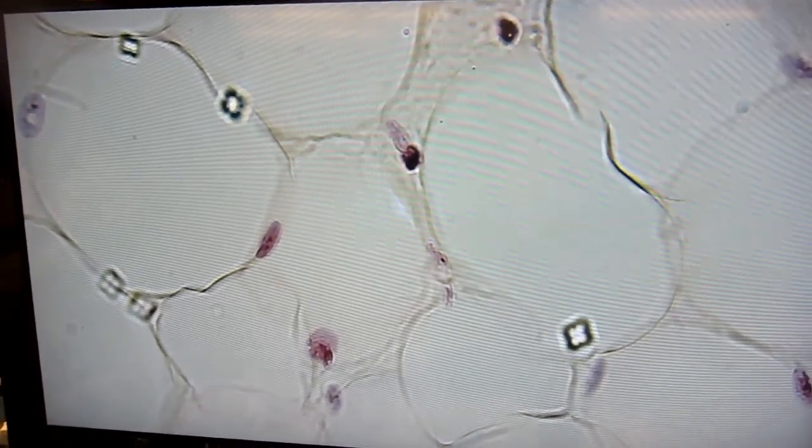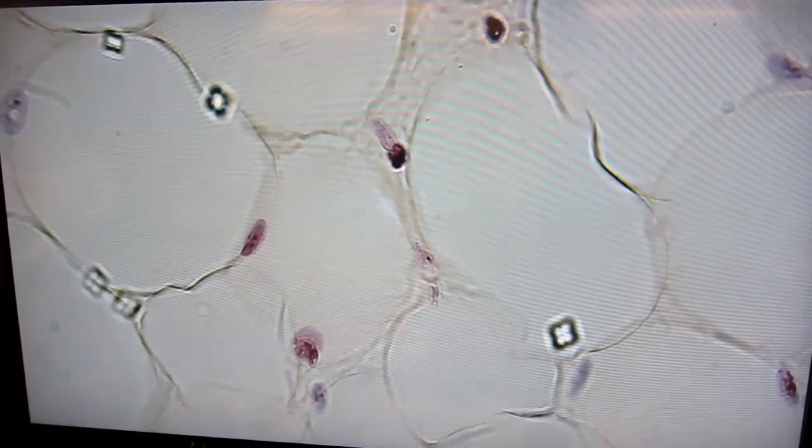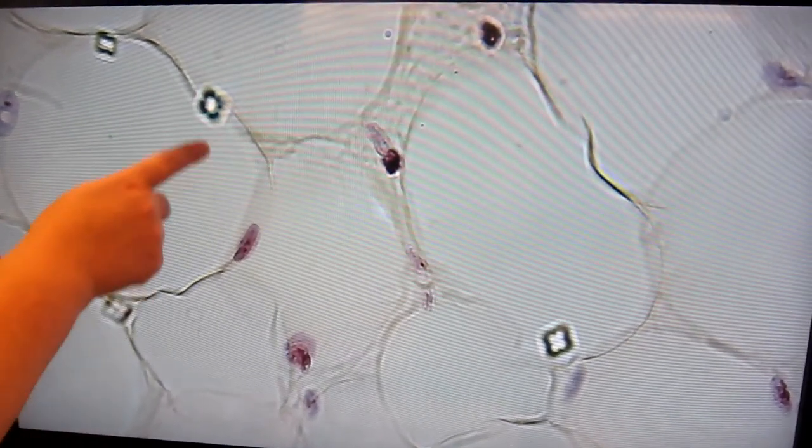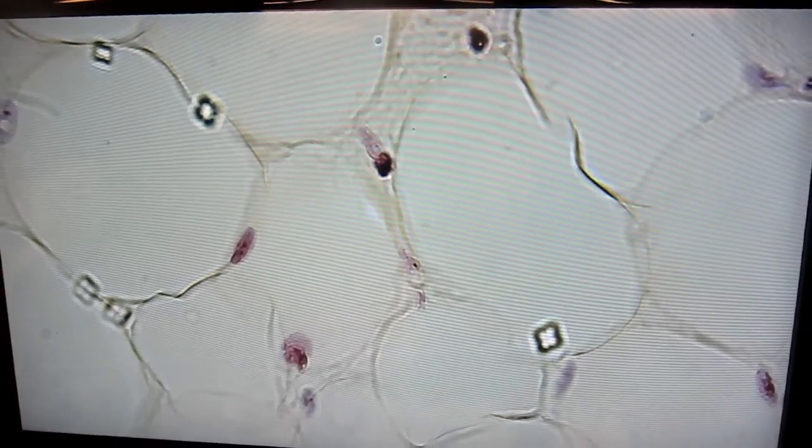Each of these round structures that you see here is an adipose cell or adipocyte. Another way to say that would be that it's a fat cell. In this space that you see here, there used to be triglyceride, a type of lipid, being stored.